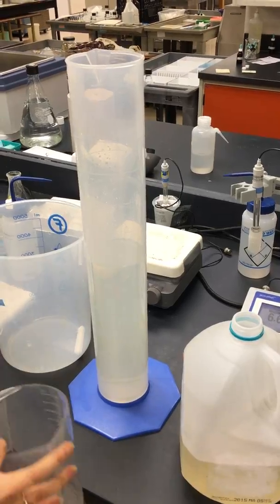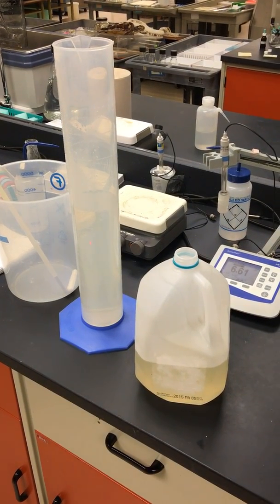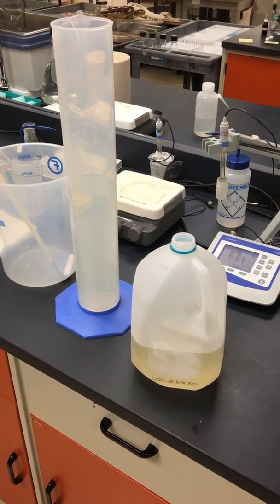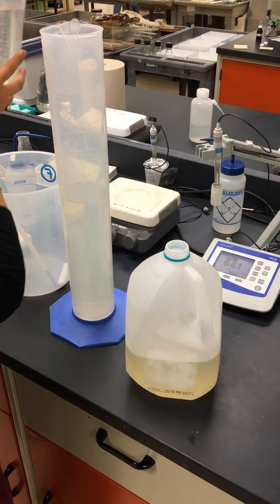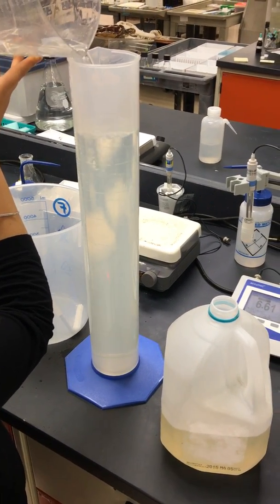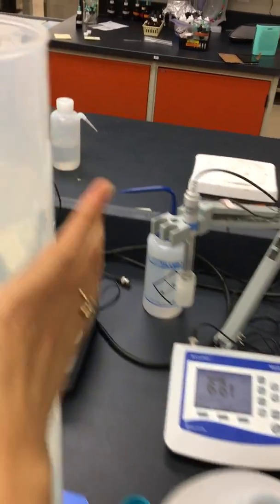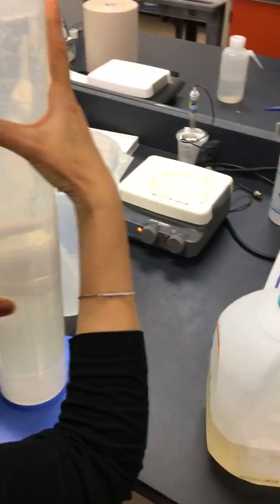We're going to get some more tap water and pour it in. The meniscus should be at 2000 and it is — it's really hard to see but it's there. Now I'm going to start pouring the rest into the jug.